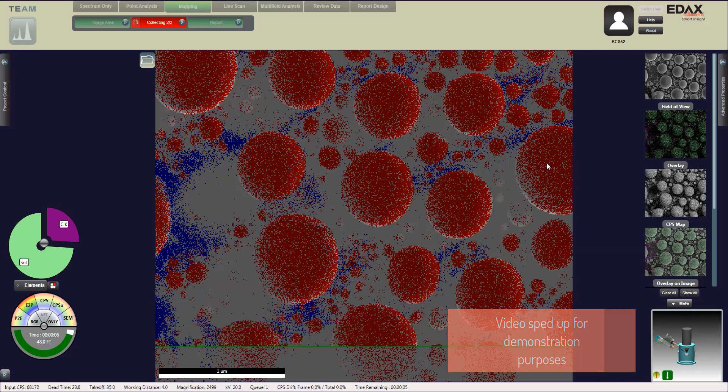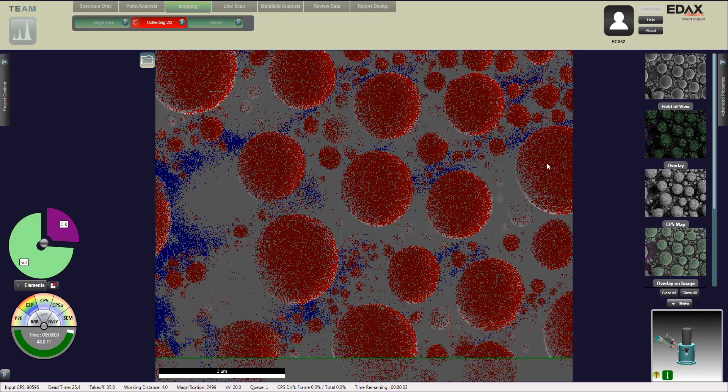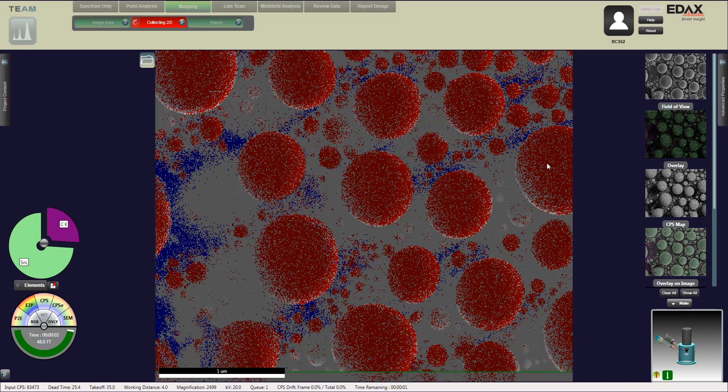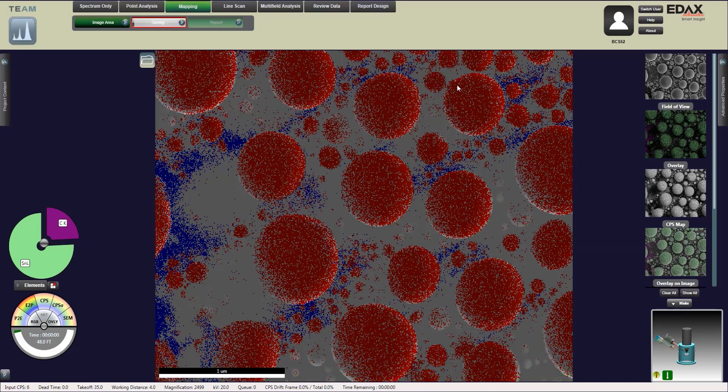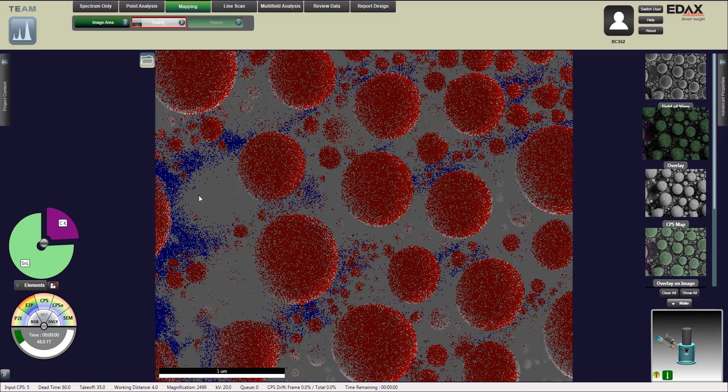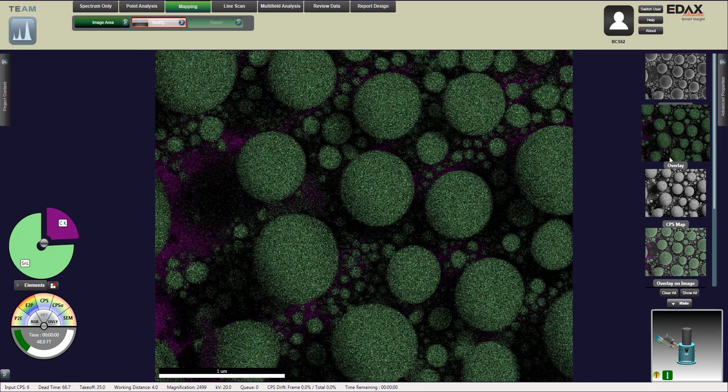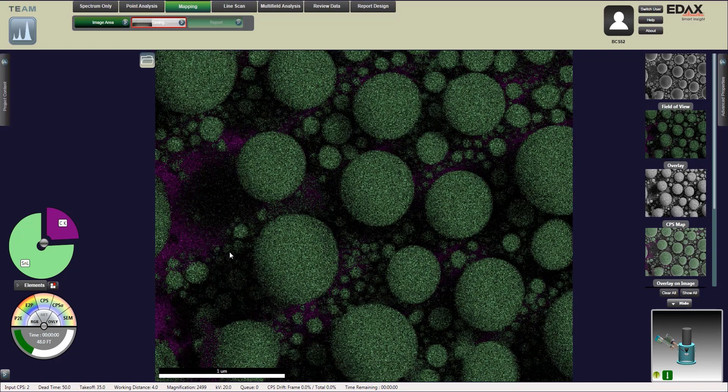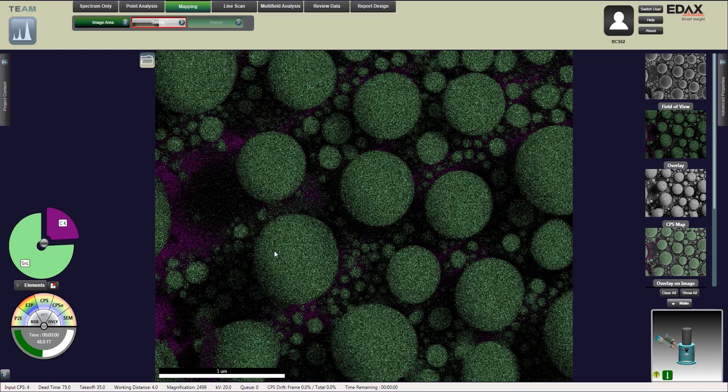Now we're going to switch over to our overlay. This is actually the elemental overlay on top of the picture. The green spots are identified as tin but the purple spots are going to be carbon.